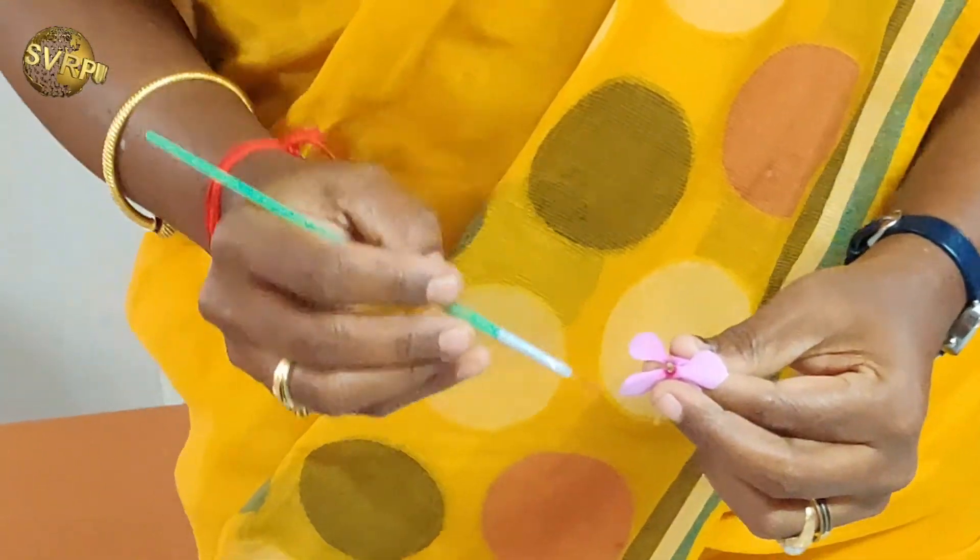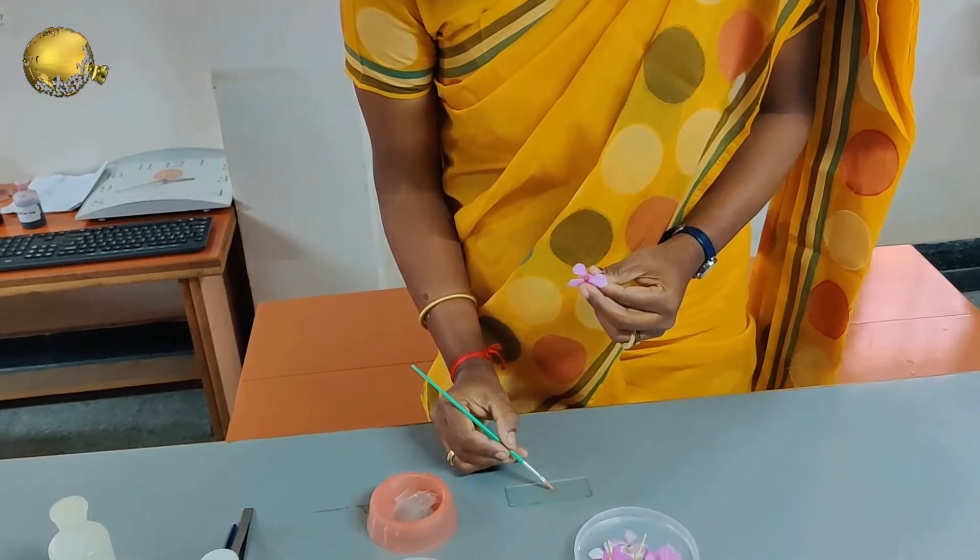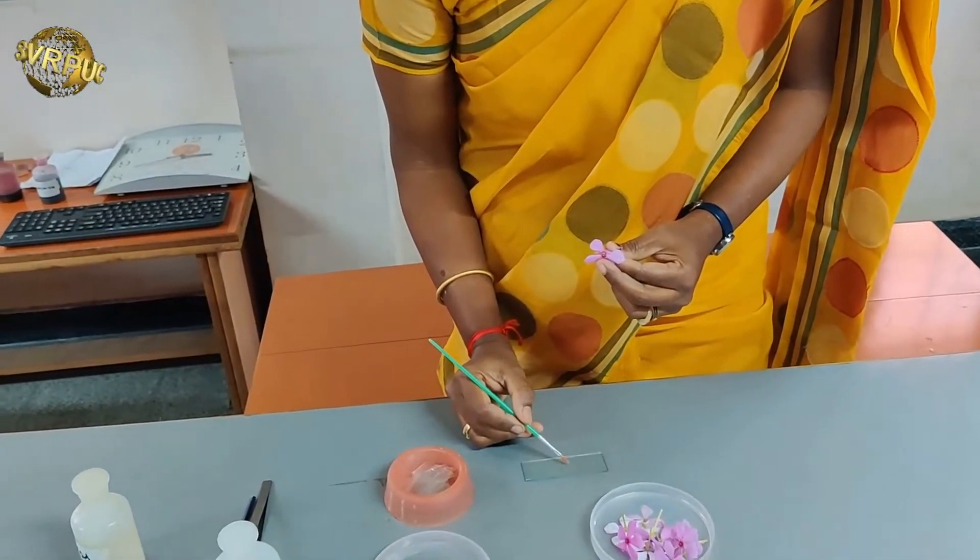Spread the pollen grains. Place it on the sucrose solution.